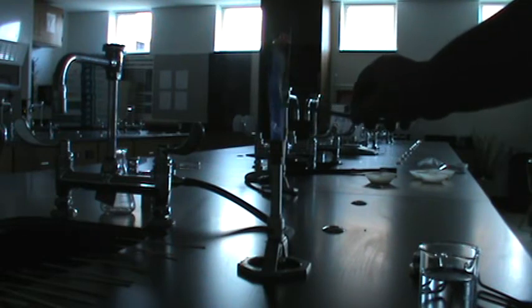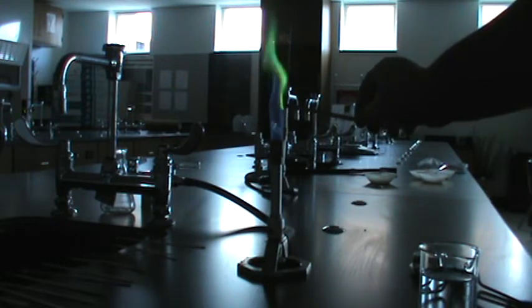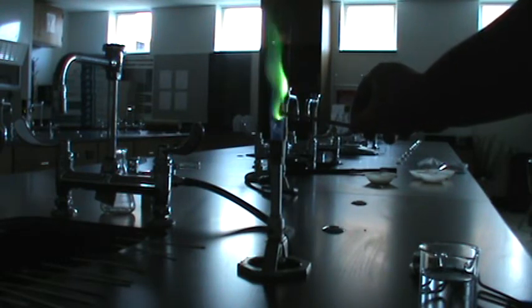Okay, next one. Copper 2 nitrate, or copper. I think that's one of my favorite ones.